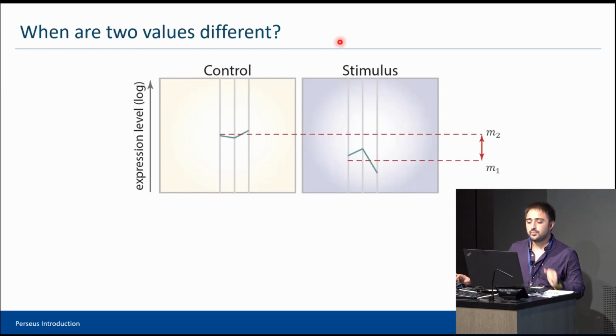Okay, so in proteomics. Hey, yes, sorry. Yes, I had two questions. The first one is about the annotation enrichment that you mentioned. How easy is it to implement a new pathway or a group of genes that I want to integrate into Perseus? Or does it only use known pathways?